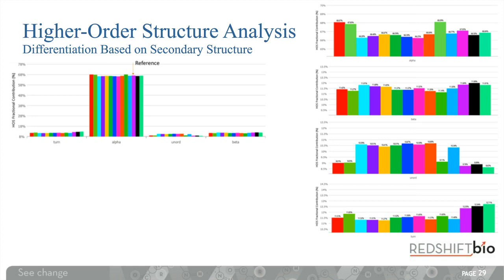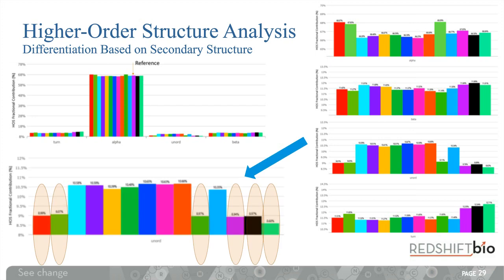As we can see here, one particular structure contribution demonstrated an interesting trend with respect to sample performance: the unordered structure. And unordered structure has been related to protein denaturation. For our case, this structure contribution seems to explain performance for our IVD assay.